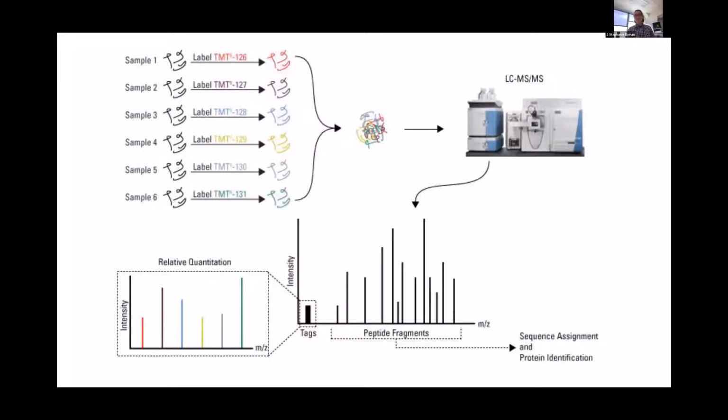And you can really see that in your PCA plots. When you run a PCA plot, the very first component is just separated by batch. There are some ways to deal with it, but it can lead to some false positives or false negatives in your data.